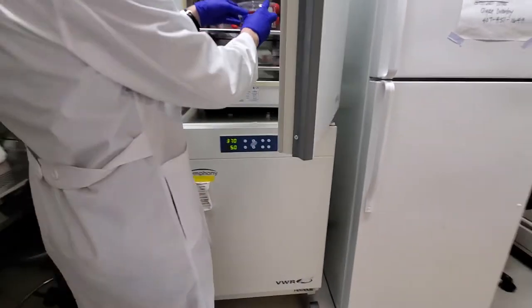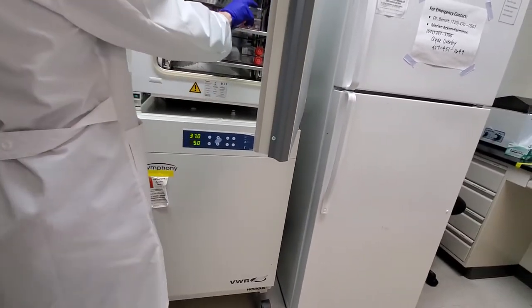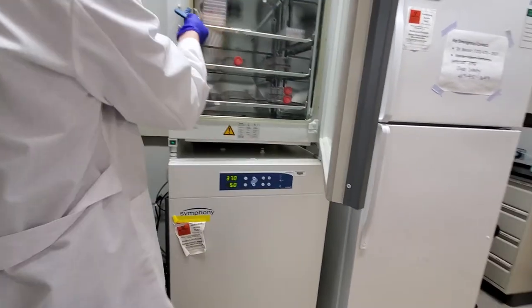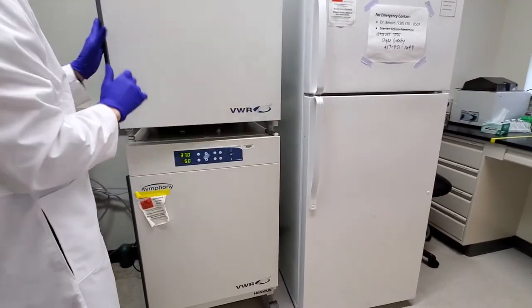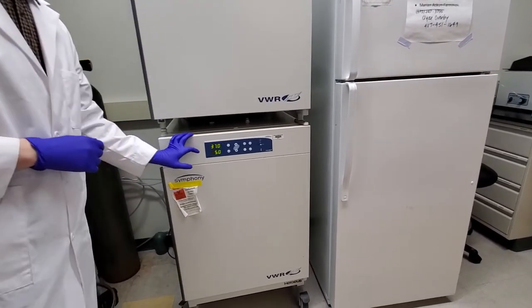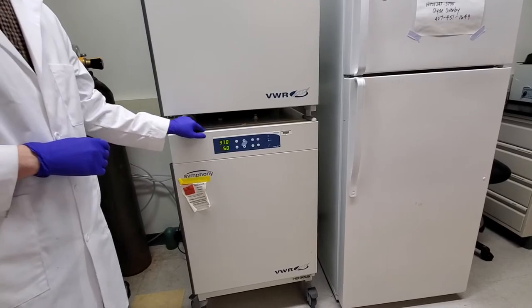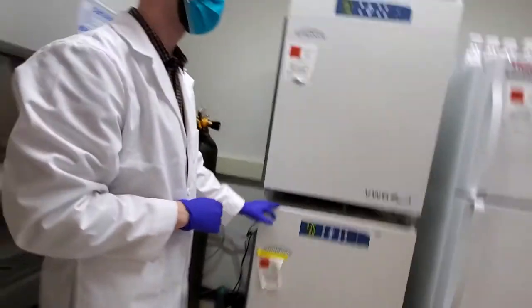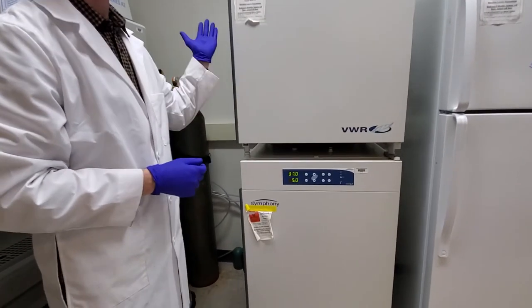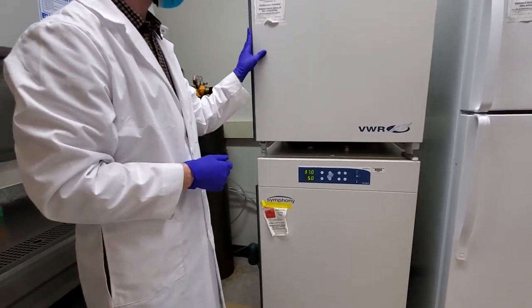So I put them in the top incubator here. I like to have the cap facing inward to avoid the air coming in and out. Typically, the bottom incubator we have under hypoxic conditions for certain cell lines that like hypoxia. This is normoxia here, and 3T3s do just fine in this.